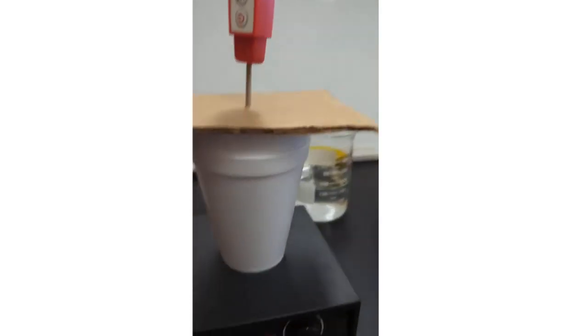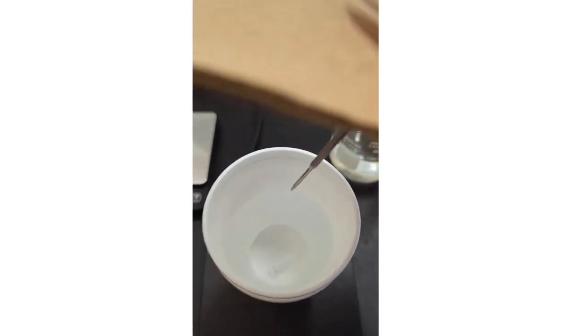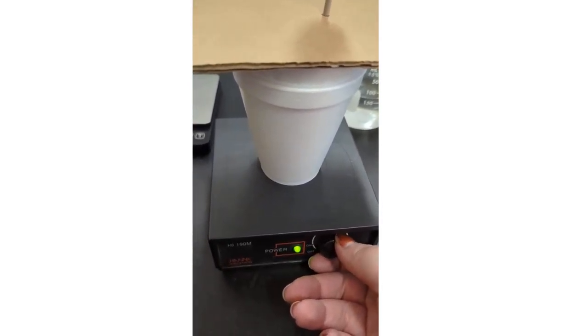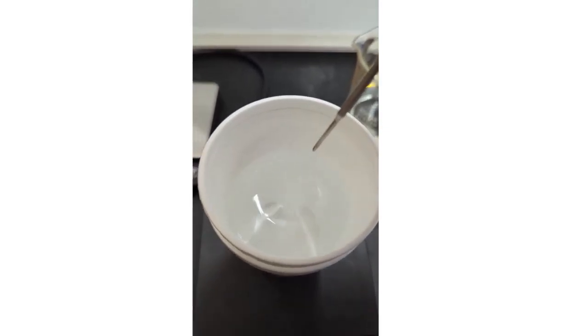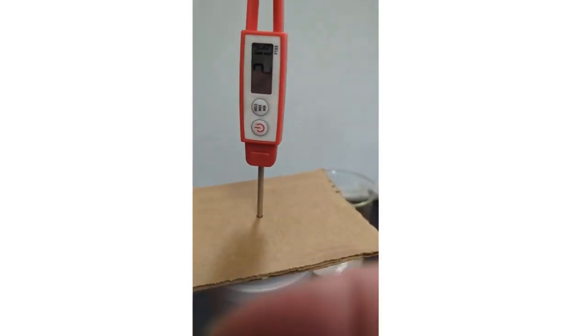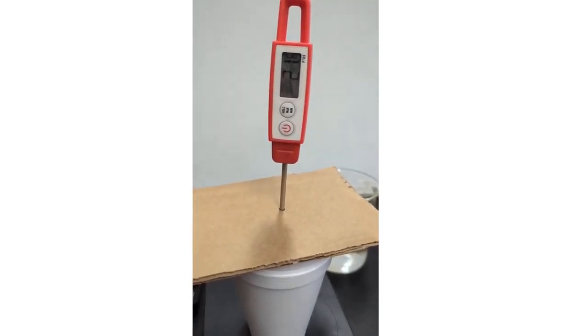So this is my stir plate. Inside my stir plate, I have my cool water sitting in here with my stir bar. The purpose of the stir bar is to make sure that everything is being heated pretty evenly and the heat will be evenly distributed inside my calorimeter once I put the metal in. So I'm gonna take this. We're gonna see the initial temperature of the water is at 21.9 degrees Celsius.